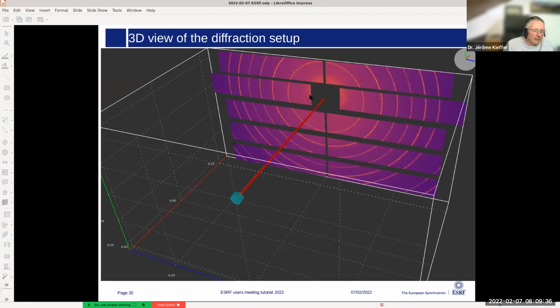So basically, all the calculation is done beforehand. If we have a 16 megapixel detector, we take each of the pixels one by one out of the 16 million. We take the 4 corners and so on. We perform the translation and rotation in space. We distribute the area of the pixel to the different bins if we perform pixel splitting.